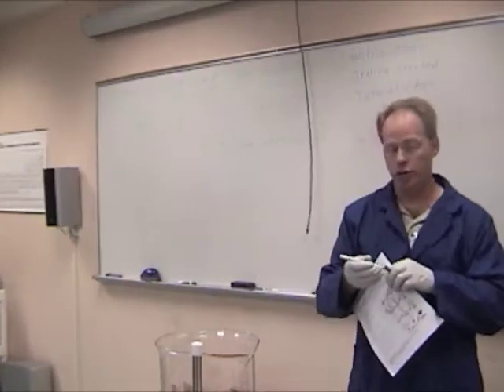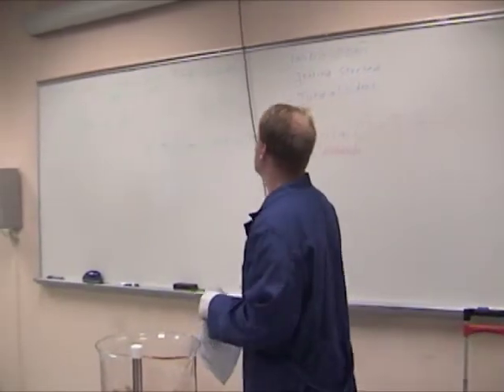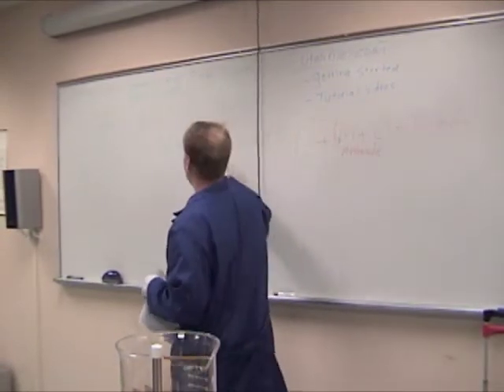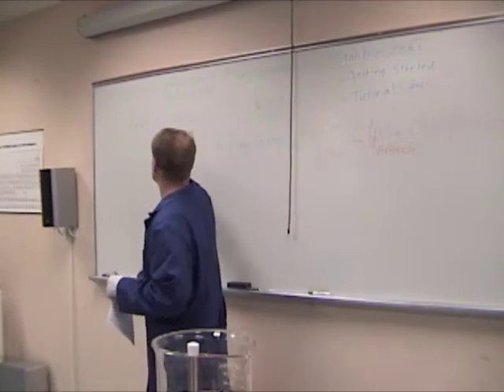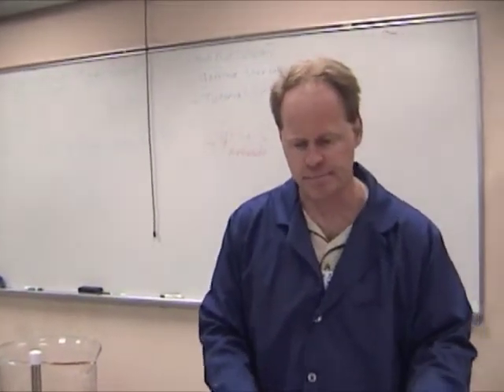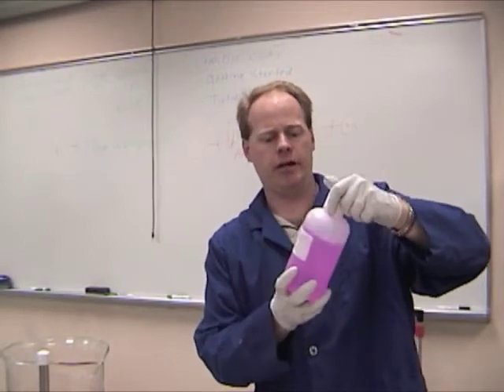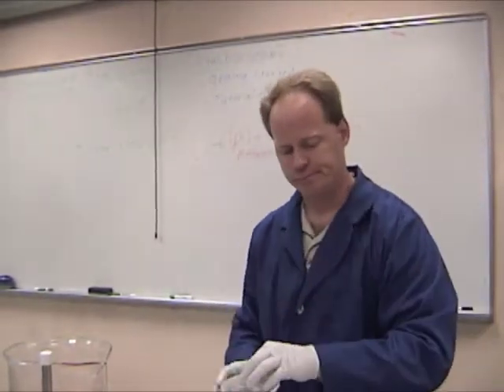Now remember, I can use sodium hydroxide or I can use potassium hydroxide. It really doesn't matter. My goal is just to get some known quantity of stuff to add into here so I can figure out how much of this I'm going to need. Okay, so let's start. I have some pre-measured stuff up here that we'll play with, but we're going to make our own.